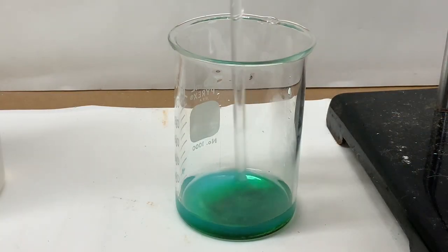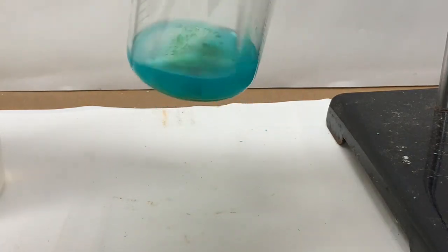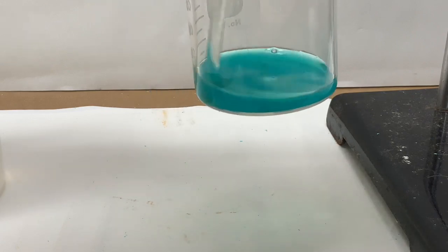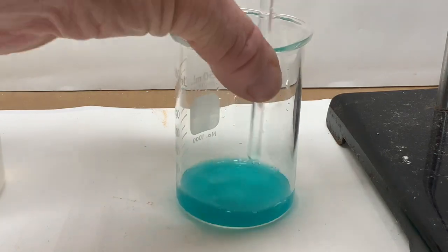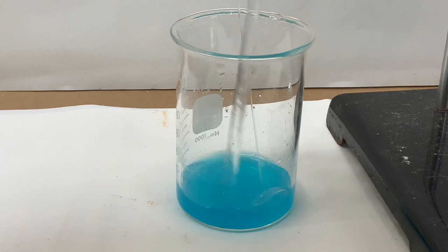The color will change further upon more water being added. Referring to your lab sheet, be sure and check another post-lab question that will ask you something about the hydrolysis of the copper ions in solution.